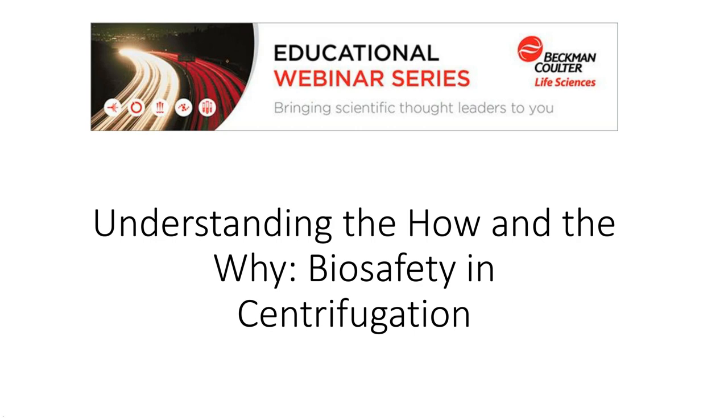Okay. Next question. Do you clean a rotor after every use? So I inspect it after every use. I don't truly clean it after every use, but if there's any reason it needs to be cleaned, it gets cleaned. And that's the moment to do it because it's going to take a little while to dry. So if you wait to clean it until right before you're about to use it, you can't use it right away.